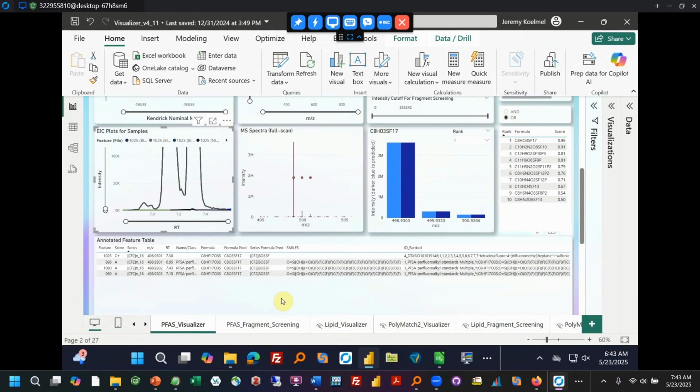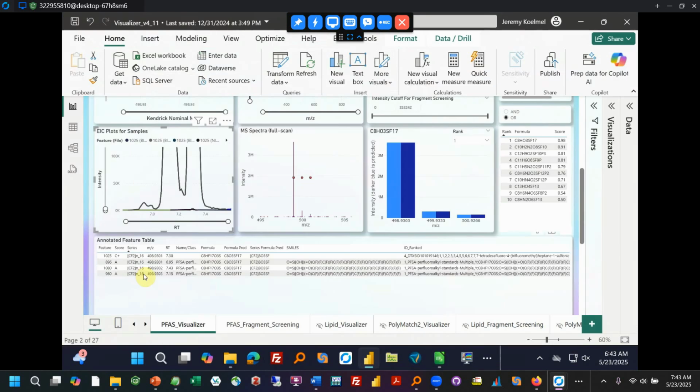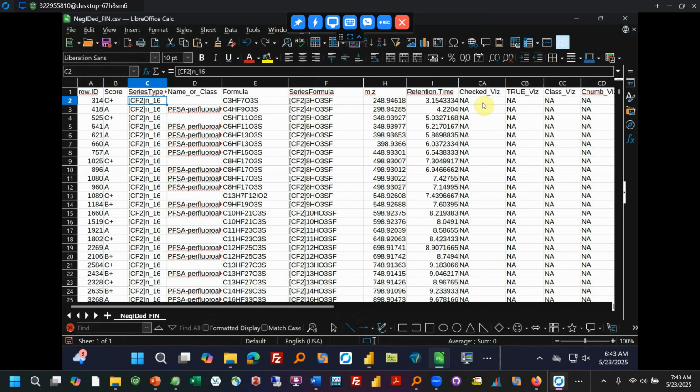And so now we can look at our table, and let's make sure we ground ourselves. So we're up to C8 for the formula already, and the one we're trying to get rid of is 7.43. So we can go to checked viz. First, I'd also freeze panes.